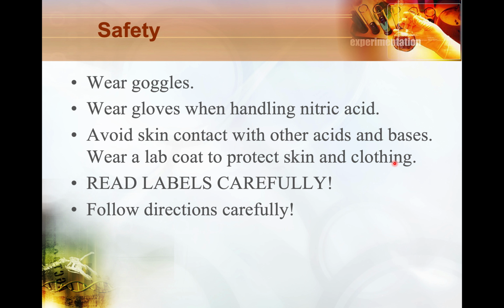We're going to be introducing a lot of different chemicals, a lot of different acids and bases, so it's very important that you're very sure what you're adding. Do not assume that this is the sulfuric acid. Do not assume that this is the zinc or something. Be sure to read the labels and don't add anything unless you know what you're adding. And again, because we're going to be doing a lot of reactions with some kind of hazardous material, make sure that you're very clear on what the directions are before you start any single step.